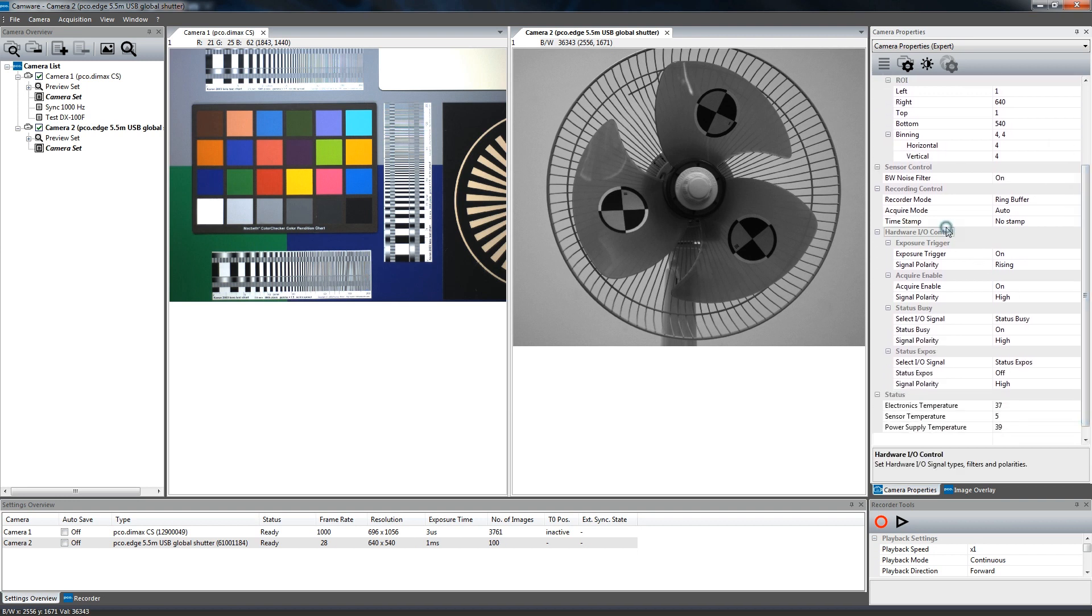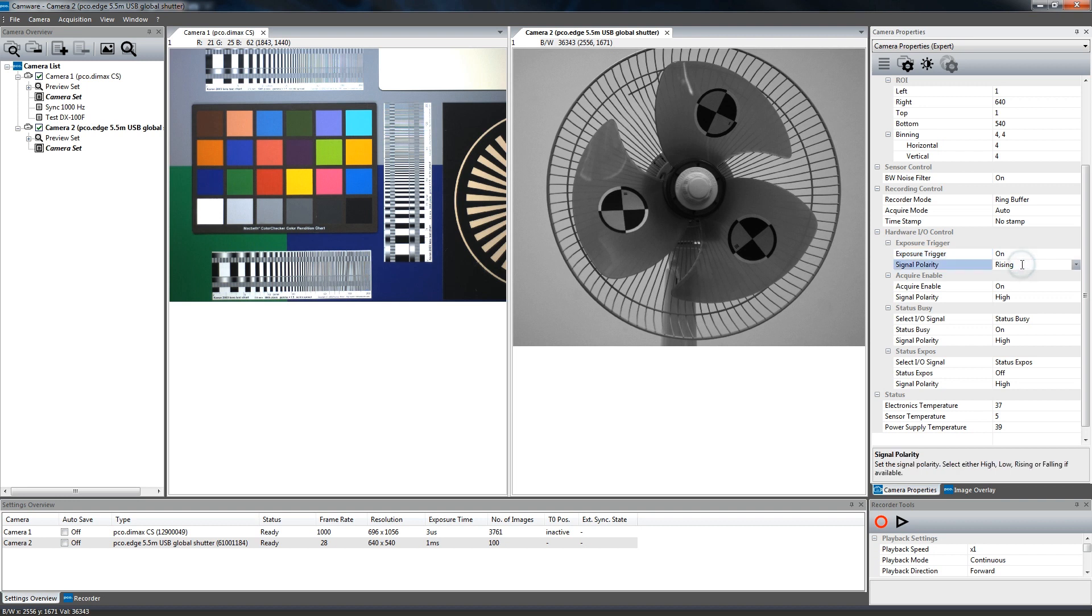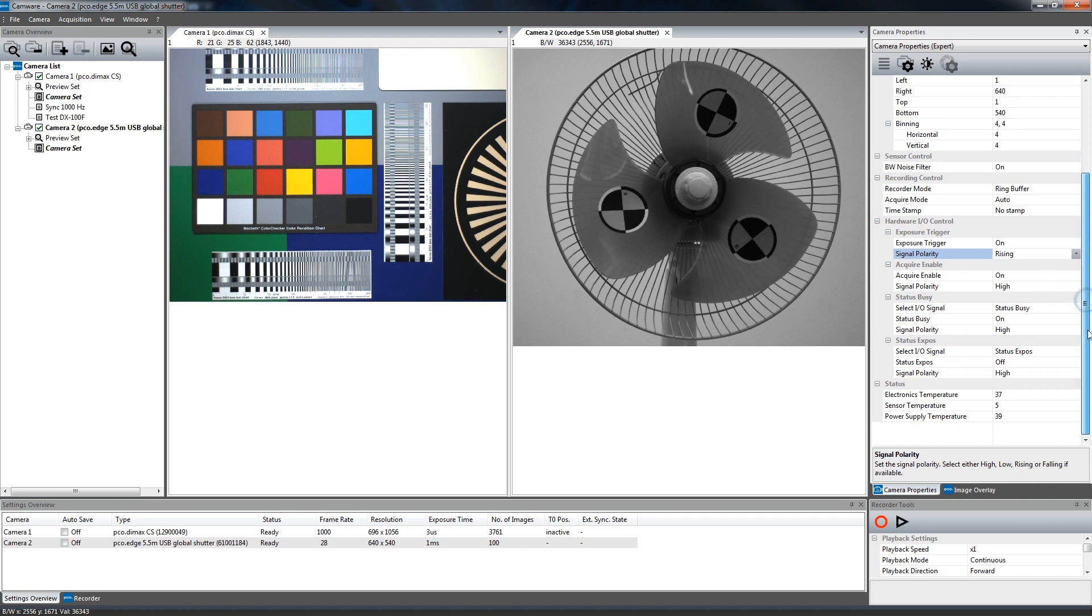Hardware I/O control offers settings for the physical inputs and outputs of the camera. For example, the exposure trigger input where signal type and signal polarity can be set.